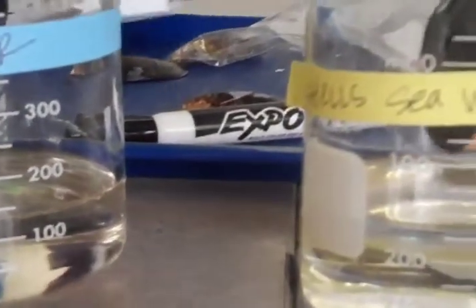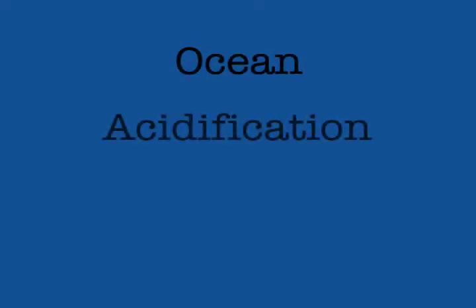This is a lab video from Science Bridge and Hi-Tech: ocean acidification.